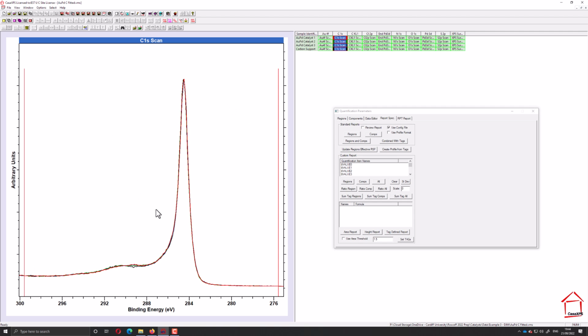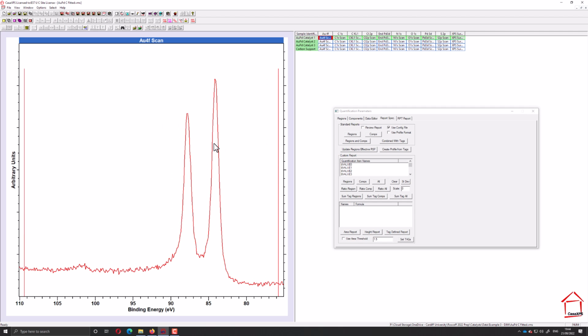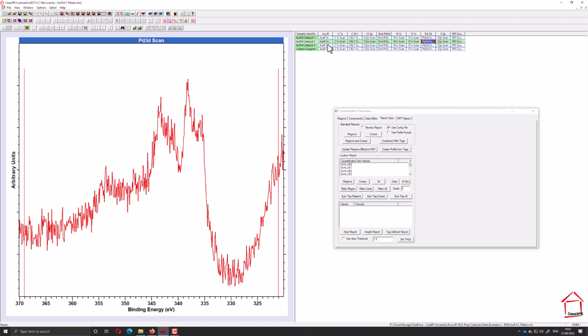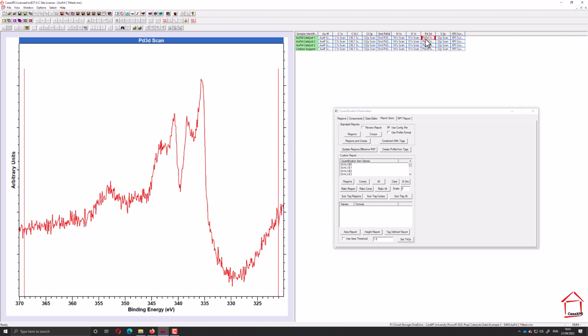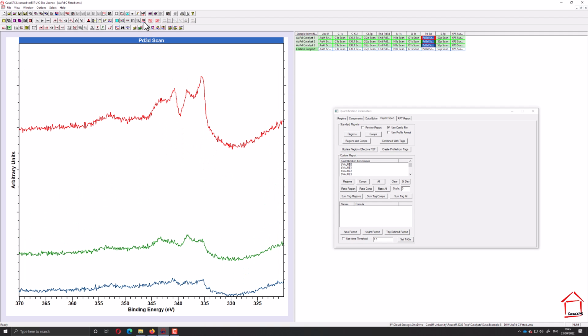is graphitic-like, or activated carbon-like, binding energy of about 284.5. There's gold in this system, and the palladium, there's gold in this one, and palladium catalyst 2, catalyst 3 again has gold and palladium. And we can see, if we overlay these palladiums, that they're normalized here, but let's just knock off the normalization.